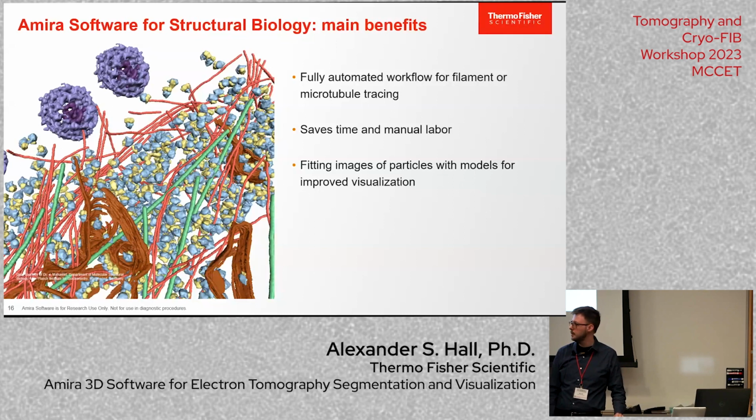Maybe you want a membrane for context of something. The data I shared a moment ago had vesicles, mitochondria, lipid membranes, and some microtubules inside of them. So the final result shows you all of those things because you can see them more or less with your eye.